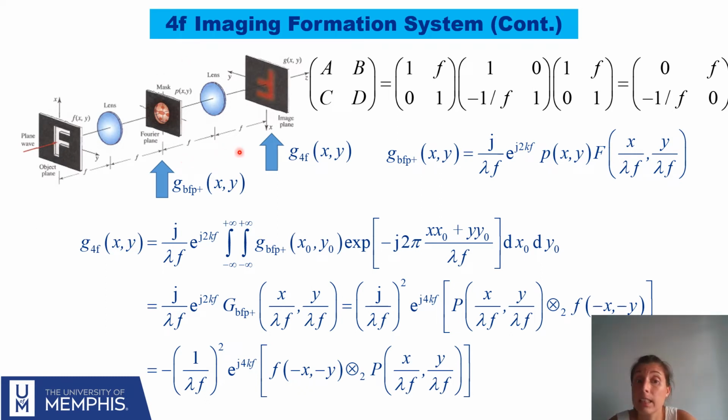And we have again a lens placed in a focal configuration. So we have the free propagation at distance F, the lens, and the other free propagation. So this is what we have now as the new input. This is what is going to be in the integral, and here we have the kernel of the Fourier transform. So what we're going to have is the Fourier transform of your input with a scaling, but the Fourier transform of a product becomes a convolution. So it's going to be the scaled version of the Fourier transform of the transmittance of your mask convolved with the inverted image. So when we have a mask in the Fourier plane, apart from the quadratic phase factor, what you have is the inverted input signal convolved with the scaled version of the Fourier transform of the mask transmittance.